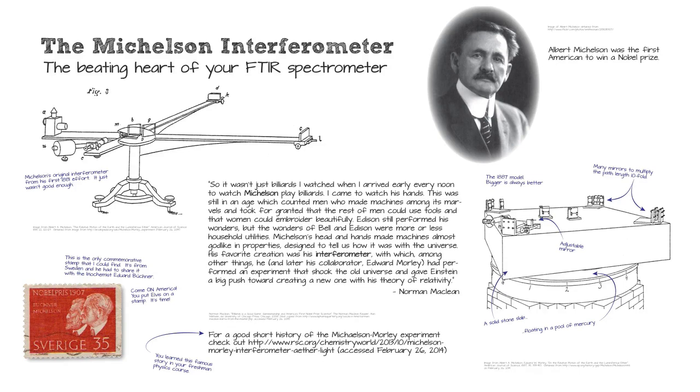You'll see that they had lots of mirrors there so that they could multiply the path length. You can read all about that if you want to read about the experiment itself. This is an interferometer. Now, what is an interferometer really? Let's take a look.